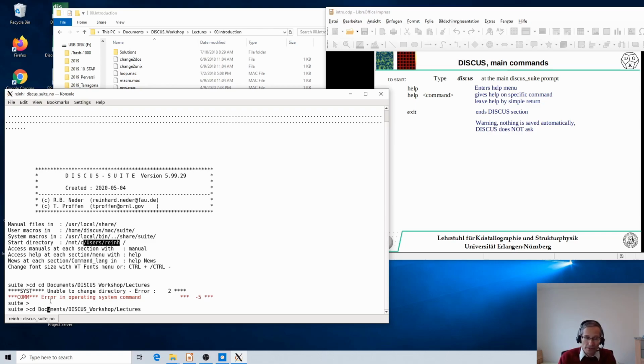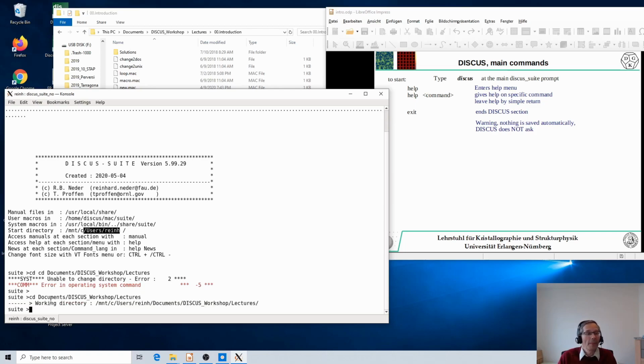Alternatively, of course, if you need to add something to the end of the command, you can type the end key on your keyboard and the cursor will jump to the end of the current line, and then with a simple enter you will get to activate this command. This last space at the end of this line is not necessary. I just did that to make it more readable with a black cursor to be off my text.